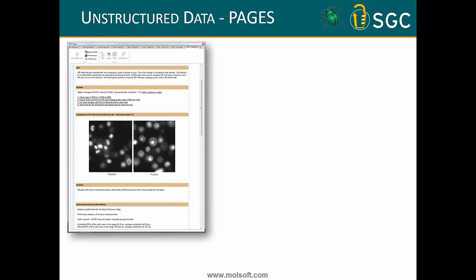So in Scarab there are two ways to get data in. There's a way to get the unstructured data in, that's the Electron Lab notebook capability, and there's a way to get data into the structured part of Scarab as well. Although, as I'll show you later, you can integrate the two things together, but for the purposes of the next few minutes, we're going to treat them separately.